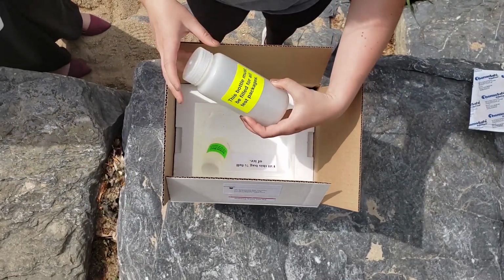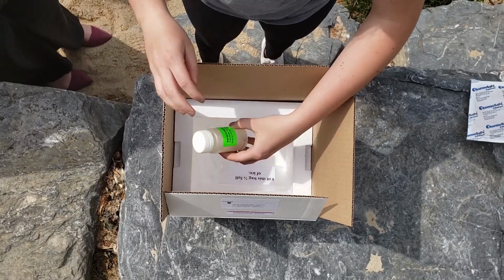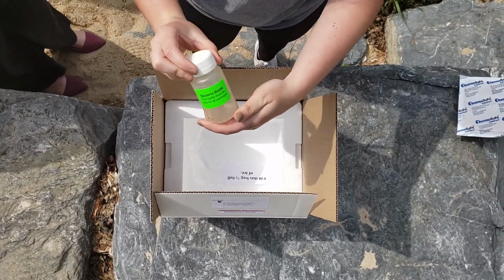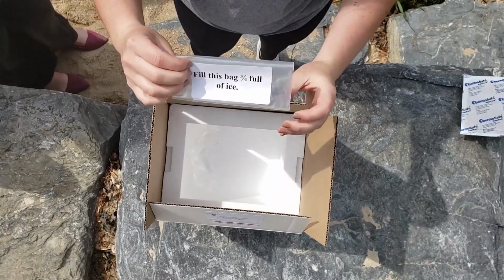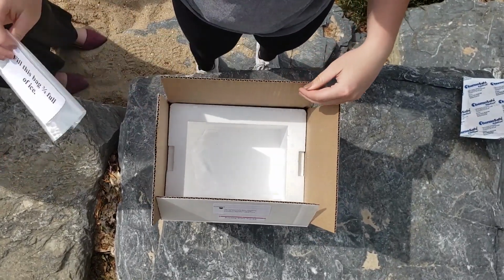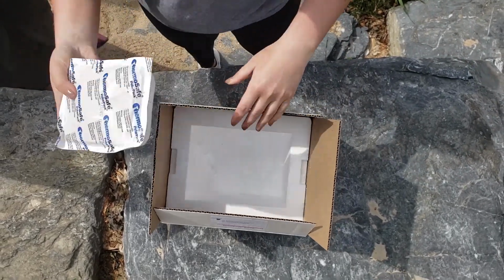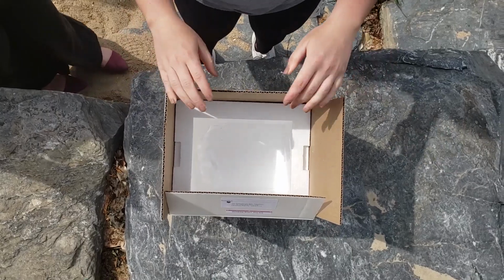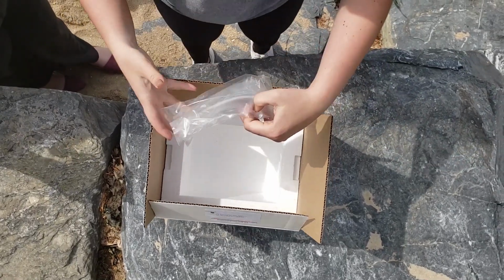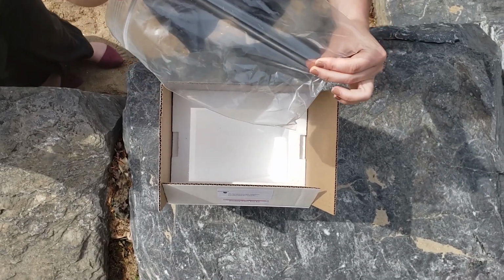Your kit will also include sterilized bottles. These bottles may contain a white pill or powder. Leave this material in the bottle when collecting your sample. Your kit may include plastic bags to fill with ice to help preserve your samples. You may also use an ice pack if your kit does not provide these. Finally, your kit may include plastic bags for your sample bottles as an extra step to prevent leaks.